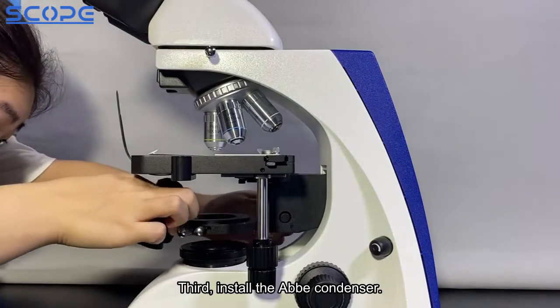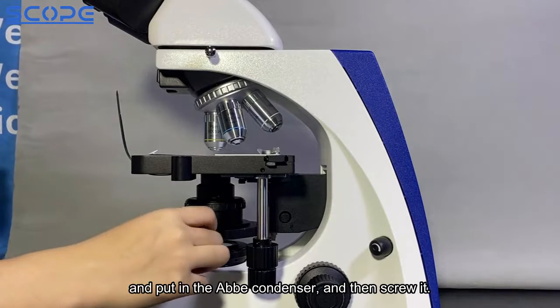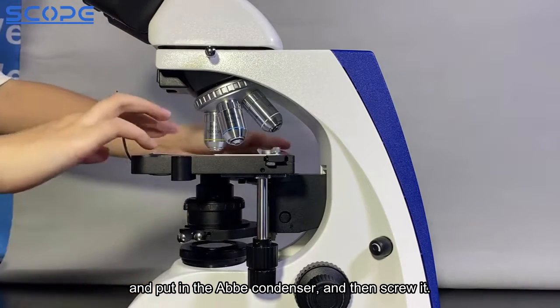Third, install the Abbey condenser. Lower down the condenser stage, put in the Abbey condenser, and then screw it.